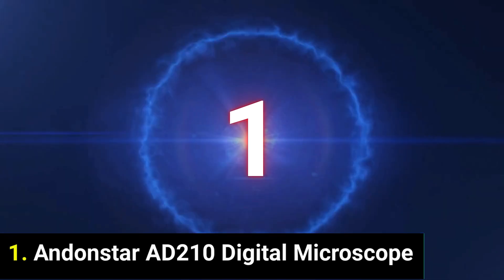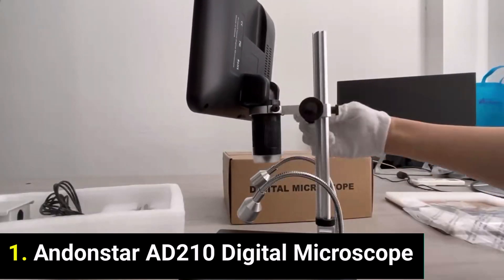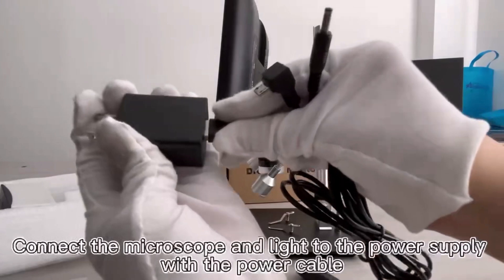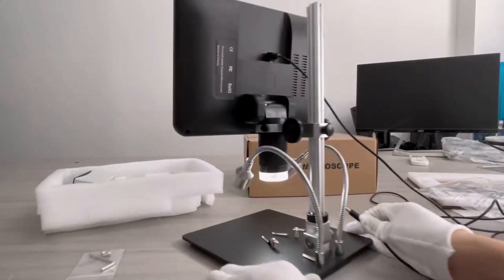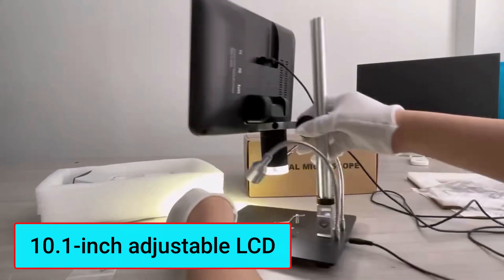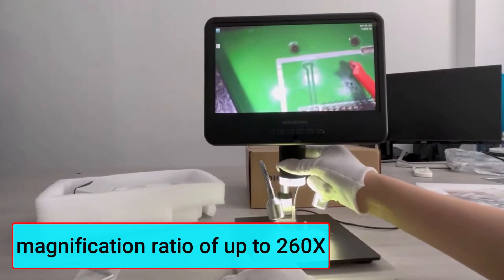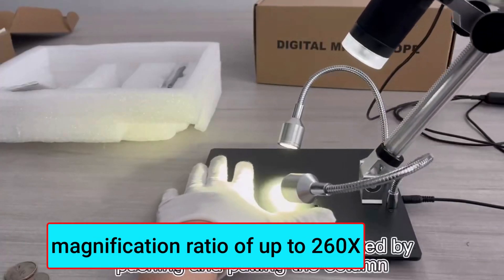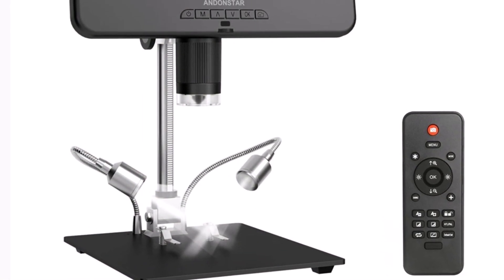Product number one: the Andonstar AD210 Digital Microscope is a versatile tool tailored for electronics repair, soldering, and PCB SMD inspection. Its standout feature is the 10.1-inch adjustable LCD, offering a sharp and large viewing area for precise work. With a magnification ratio of up to 260x, it provides detailed imaging suitable for professionals and hobbyists.